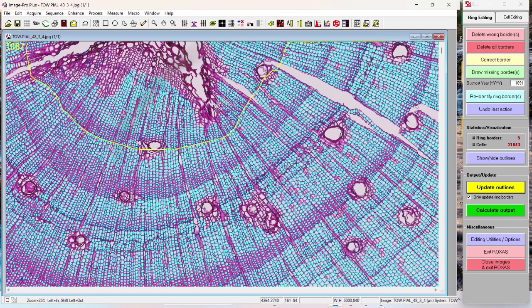I don't know why this disappears when I'm trying to film this, but I think it's supposed to end in 1876. So I haven't written or drawn all of these yet, so it still says 1887. But if you get to 1878 and after that the boundaries don't want to cooperate, then just end it. Say I had to end at 1878, so we know what the start date is for that sample.